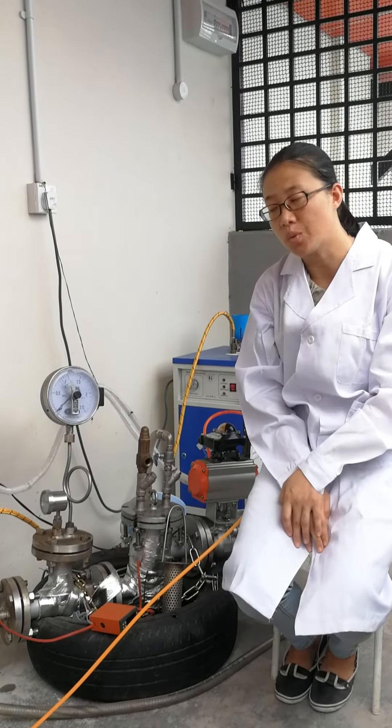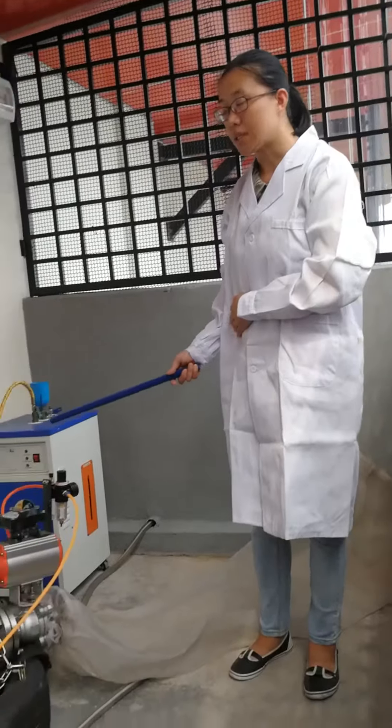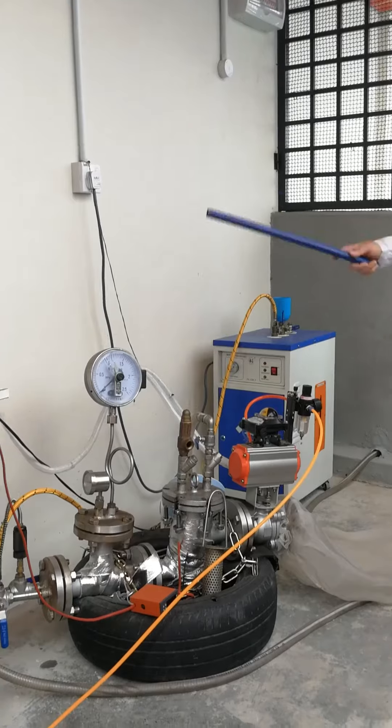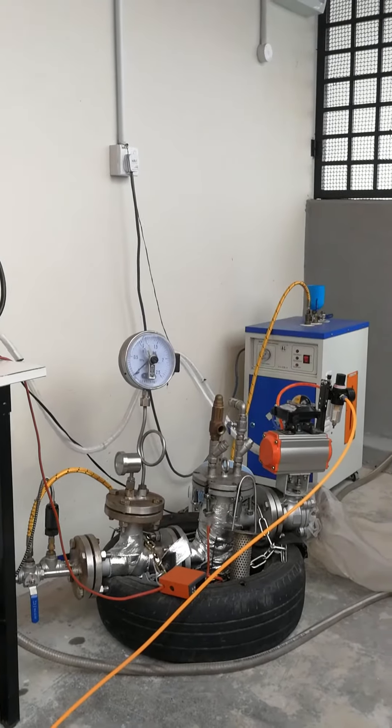In order to reach this target, we designed this system. The system includes three major parts: raw material inlet system, reactor, and sample collector.